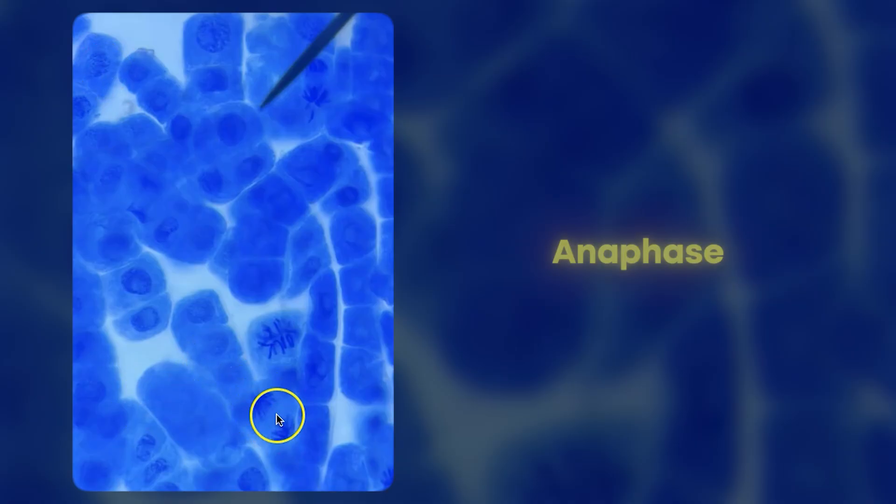All of these where you can't see the individual chromosomes, it looks a bit like a blurry, shady part, that would be interphase. Whereas this here is a cell in mitosis in anaphase, because we can see the chromatids have been pulled to opposite poles. This one here is in metaphase, we can see those chromosomes lining up at the equator.